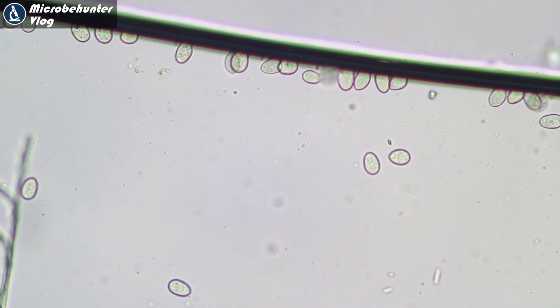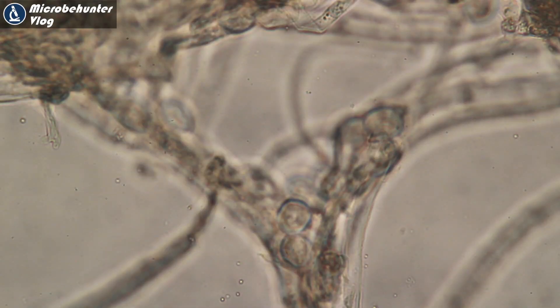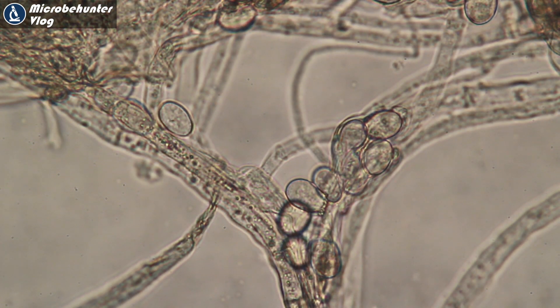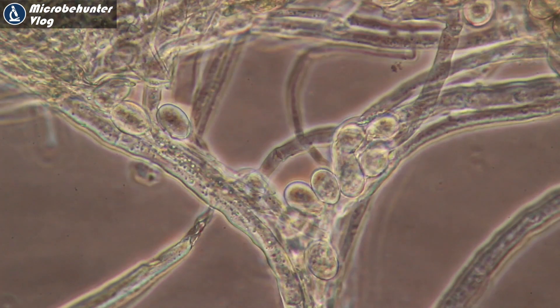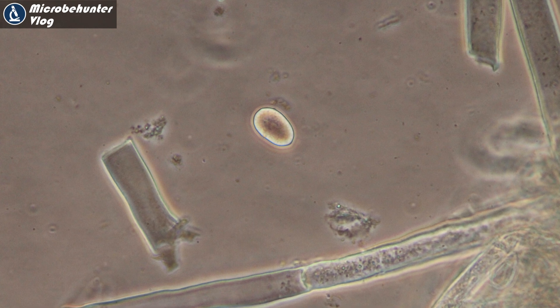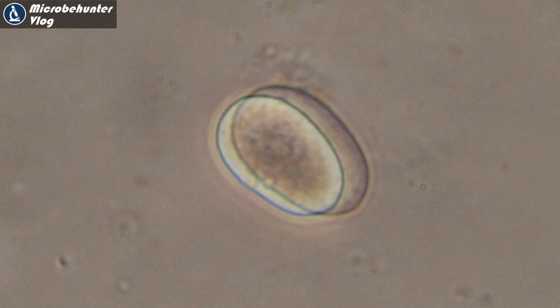That approaching object from the top is an air bubble — we're at the edge of the slide and the water is evaporating, pushing the spores along. This here is still in brightfield, just to have a close look and remember how it looks, because in a second I'm going to switch over to phase contrast so you can see how the image looks different. Now we switch over — focus again — and look how the contrast is different. That is phase contrast now. It's actually much better visible because the spores and the mycelium now have a strong contrast to the background. Here again a spore: that is brightfield, and now here again in phase contrast — much better visible. And the last view here, really zoomed in: brightfield and then switching to phase contrast.